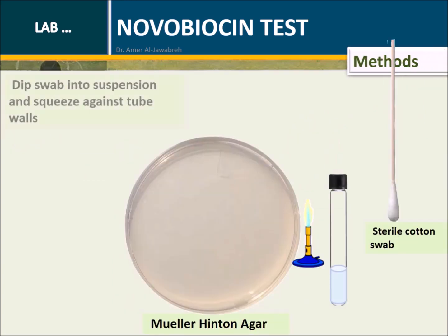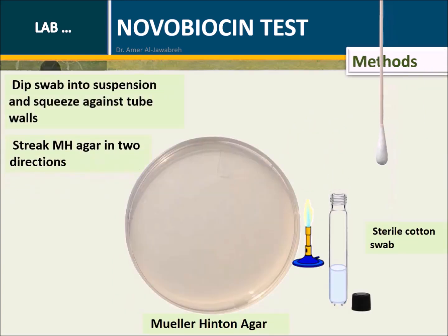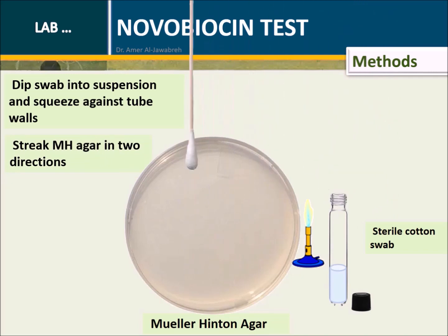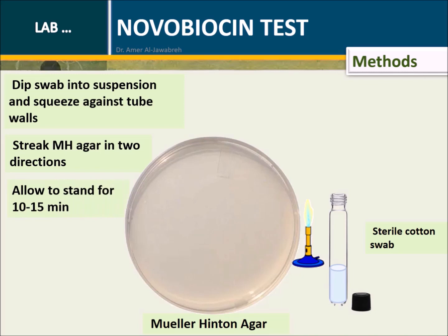Methods: Dip a swab into the suspension and squeeze against the tube walls. Streak Mueller-Hinton agar in two directions, then allow to stand for 10 to 15 minutes.